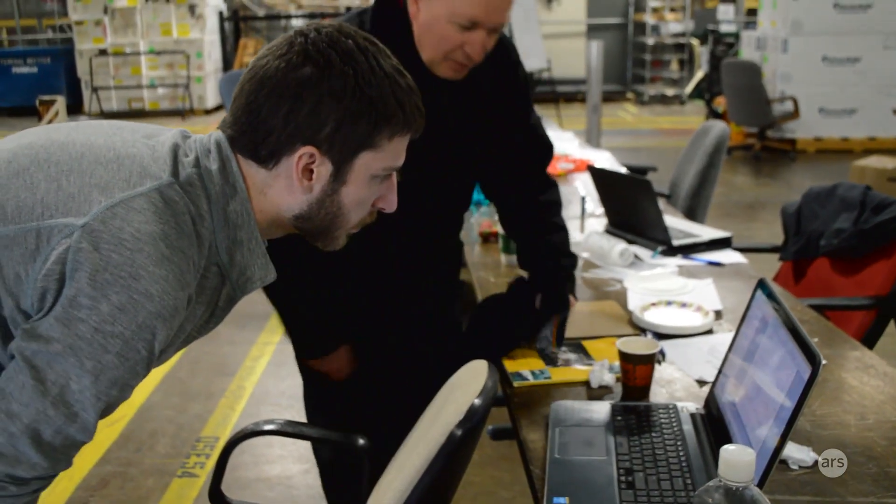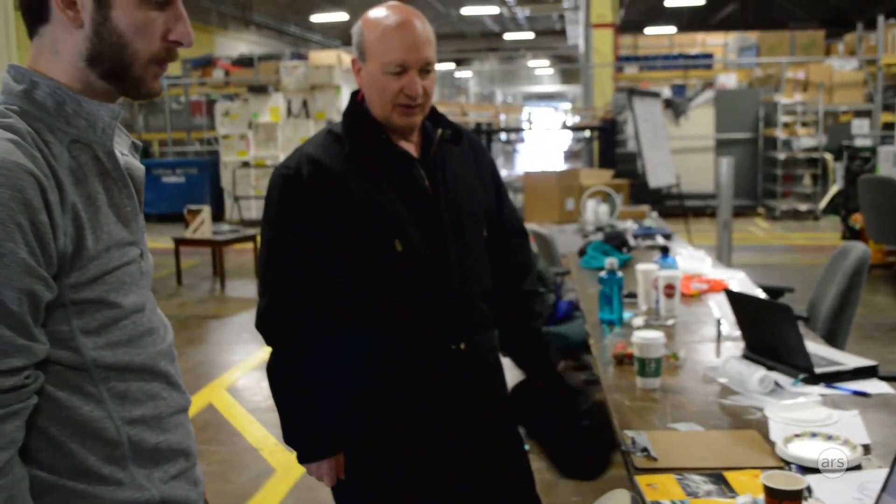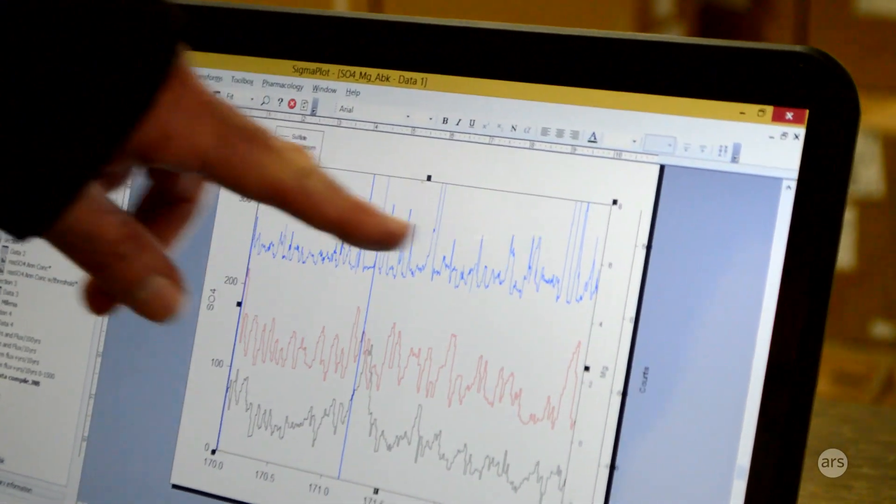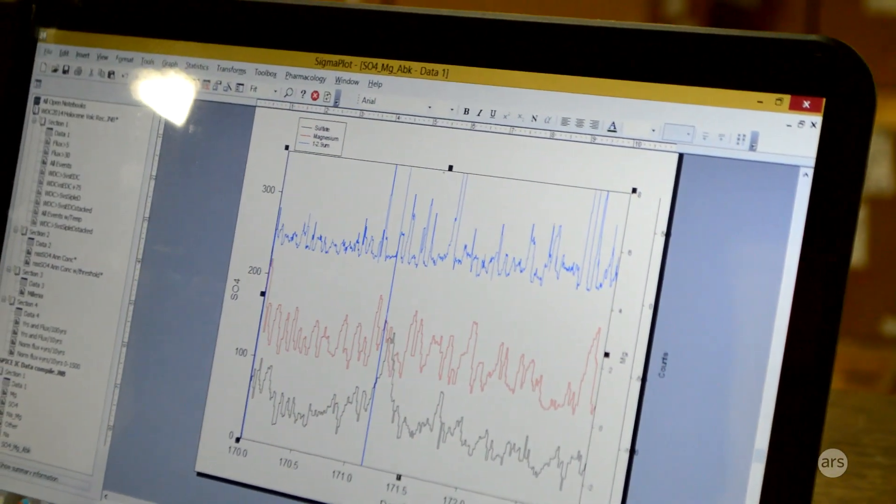Our portion involves doing the chemistry on the ice core. The primary purpose of that is to date the ice core. You get seasonal changes in different chemicals in the ice for various reasons, and if you can get samples small enough, you can actually see those changes and count annual layers going back in time.